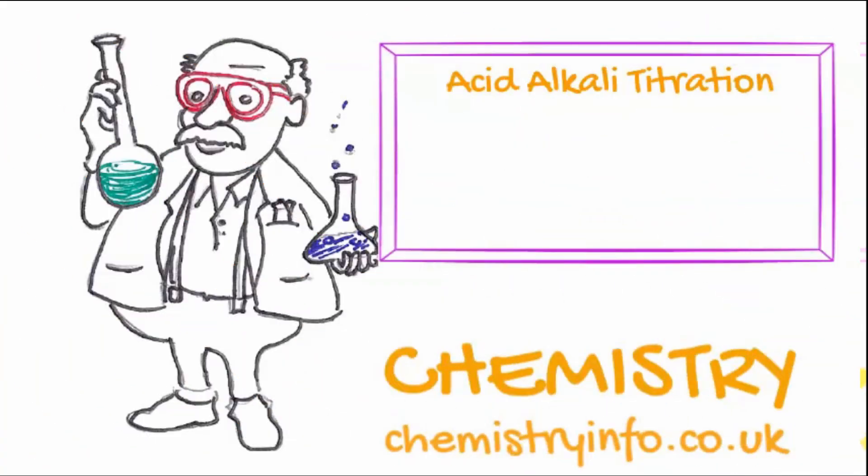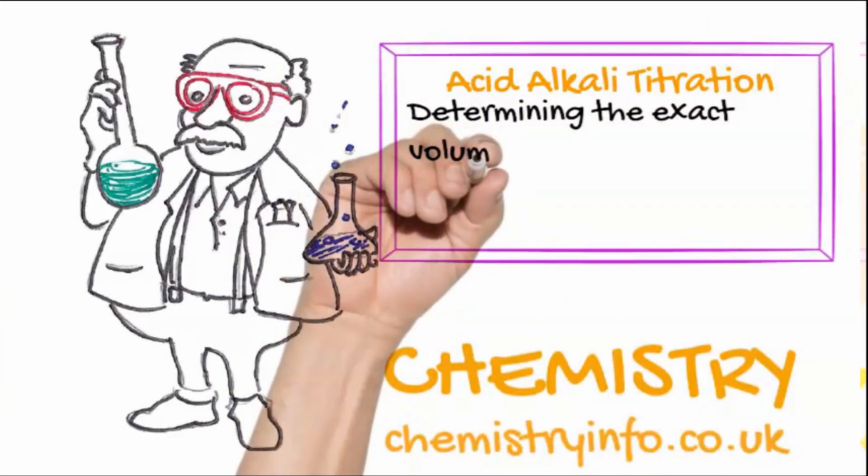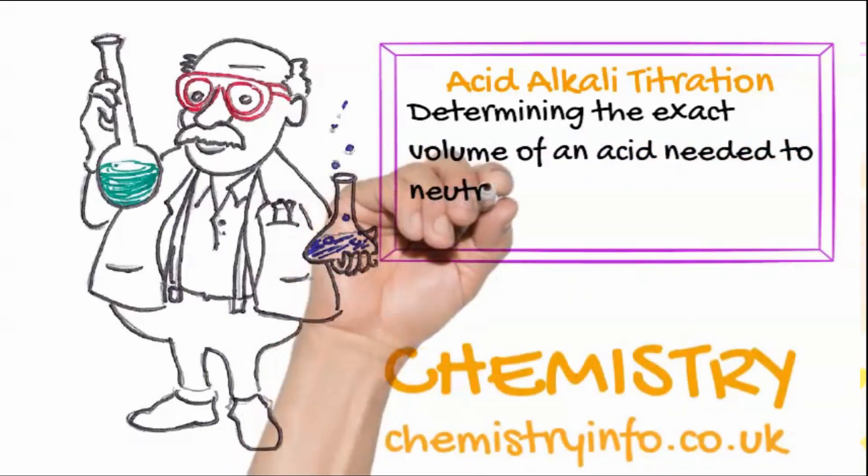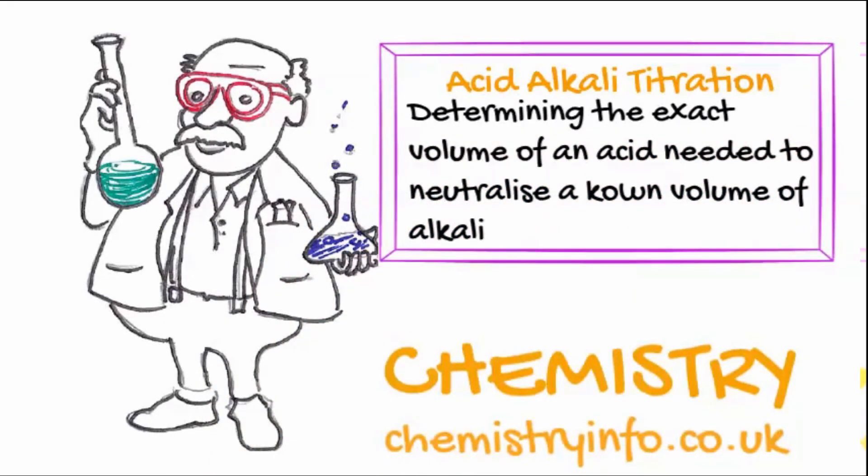Cool practical: acid-alkali titration. Determining the exact volume of an acid needed to neutralize a given volume of alkali.